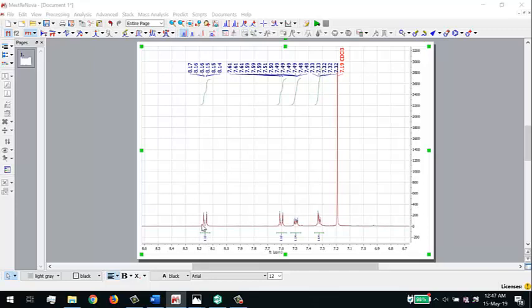Remember that we are expecting 9 protons, and we see over here, let's round the numbers: 1.1 we're going to round to 1, 1.12 round to 1, 1.14 round to 1, 1.64 is not an integer, it's not even close to an integer. So let's sum these numbers first. The sum of all this integration area rounds to 4.5, which is a fraction. It's exactly half of 9.